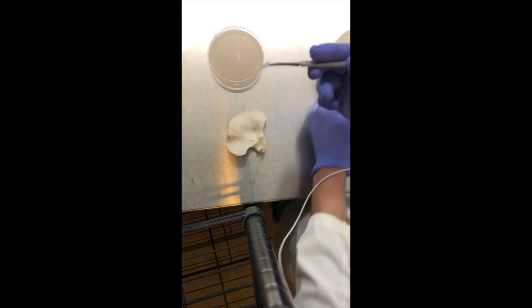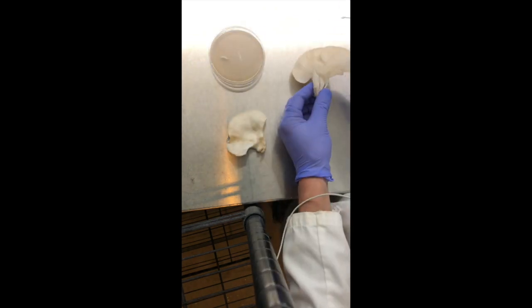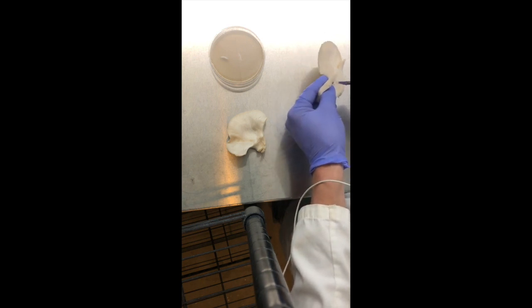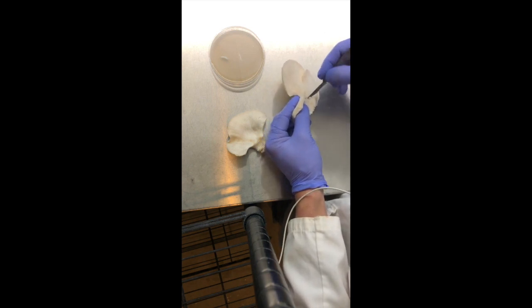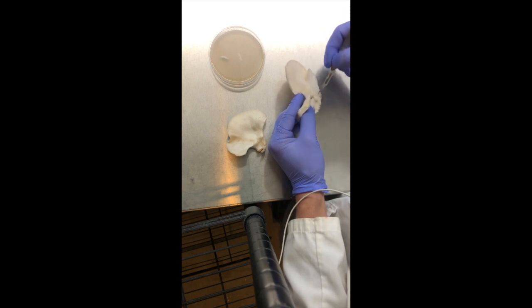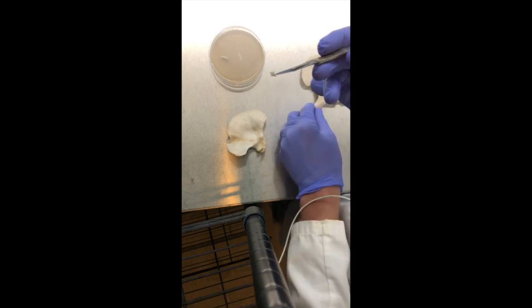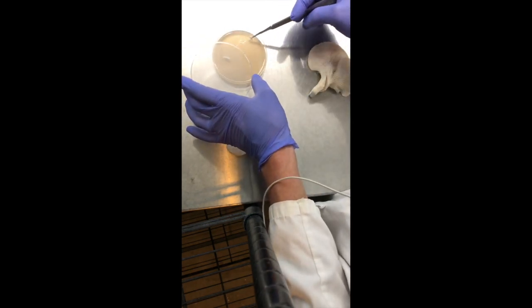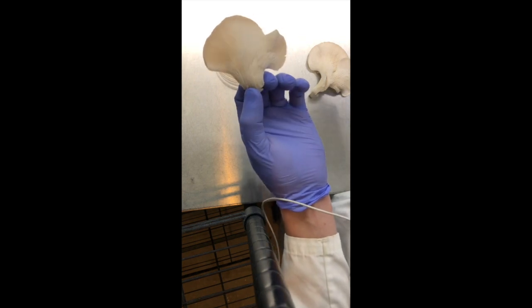I'm making a cut — as you can see it's like a triangle shape — and now I'm transferring it to the petri dish. I'll make about two or three more cuts and put those on the dish, which will allow me to observe growth of the mycelium in the next few days. I'm holding the mushroom open with my left hand and making the cuts with my right hand, making sure the tissue I'm grabbing is not in contact with the outside of the mushroom.